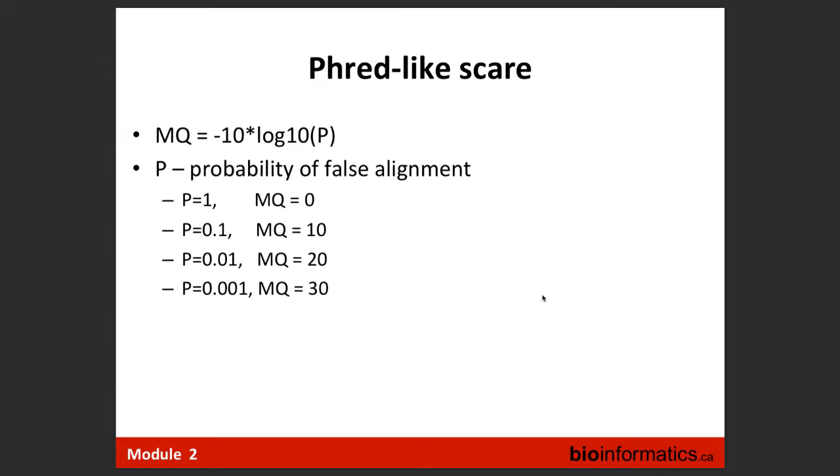Yes, that's one of the applications. Probably there's something else. Well, it's in the extension, right? I'm not sure it's used in the extension. In the seed region, basically, we're not using it. Not used, but there are many parameters in how you extend the read past the seed. It's heuristic, yes. For example, it could be the sum of the base qualities of all the mismatched bases, so if you had a mismatch with a higher base quality, you might have less or more confidence in that extension. So that's a parameter that can be set in BWA where it uses the base qualities, but it's not true within the seed region. Okay, so I missed this part actually. Thanks, Martin.